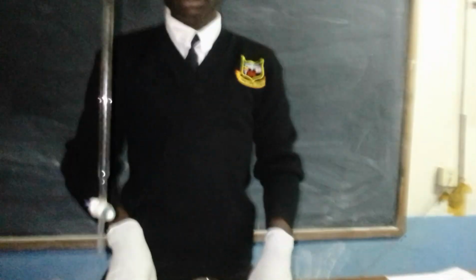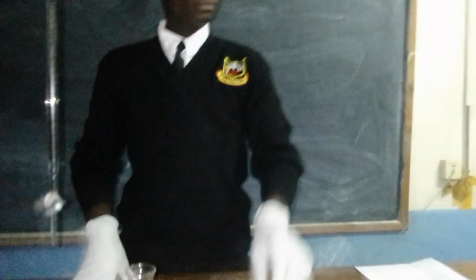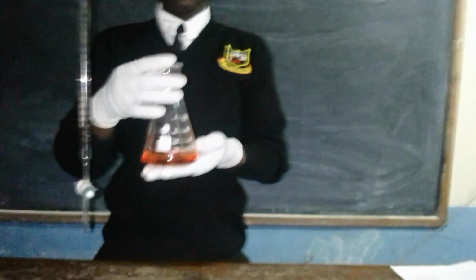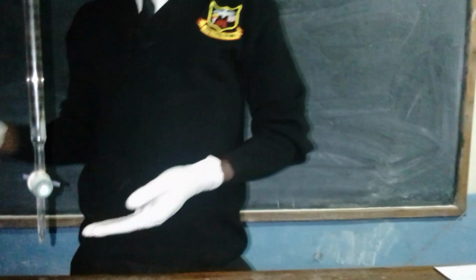If you are supposed to follow the laws of titration in the table, make sure that you maintain the one decimal point while recording the results. Or if you have decided to use two decimal points, just maintain two decimal points. In this case, we have decided to use one decimal point. So we have obtained 38.0. That is our final burette reading.